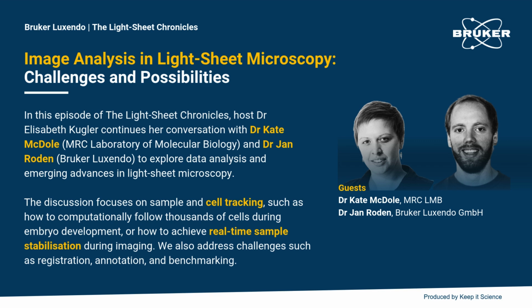But very important. Some samples like to run away. It's not even that they drift. They're afraid of light and they will swim away. Oh, absolutely. And also just as examples of cell growth, right? If we think about things like the lateral line in zebrafish, where it literally moves and you have to follow it over time, it's so important to have that tracking option. I had a lot of experiments that went wrong and my cells just grew out and you're just like, no, data loss. I get it. It can be very frustrating. So it's good, and it's very, very important.